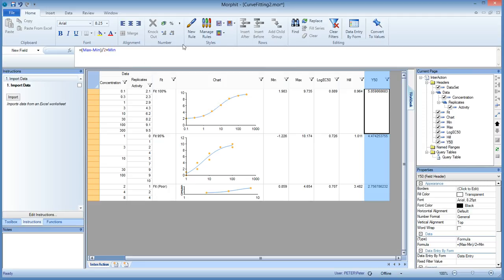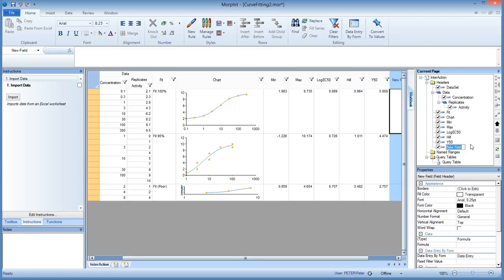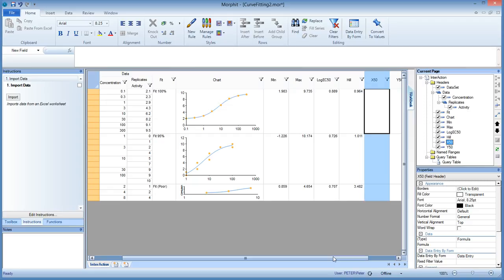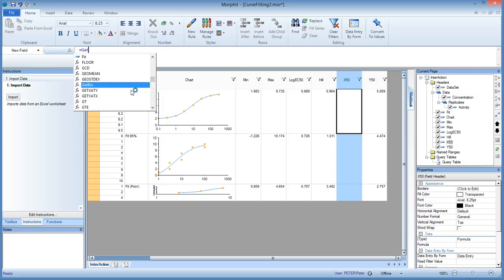And then we reduce the number of decimals here and then we add another data point and that is the X part of that coordinate. And let's swap these. So we move it down with the arrow here. This is the way you can order all your fields in the binder in the table.